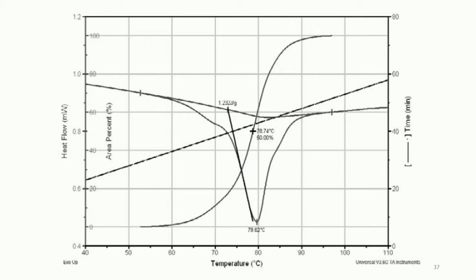A plot of time during the experiment shows that the entire experiment took only 60 minutes, which is faster than typically obtained with microcalorimeters or solution calorimeters.